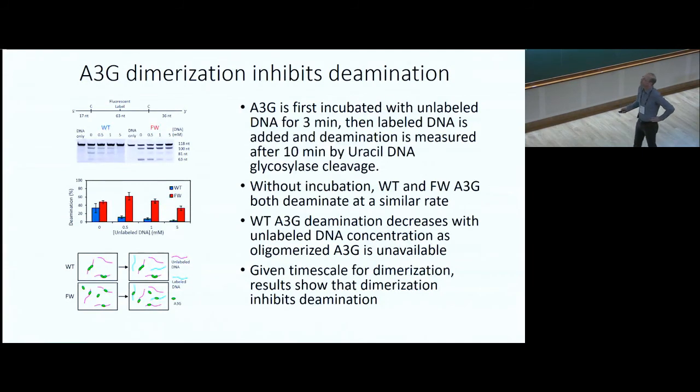Okay, and so what you get is a gel that shows you the different lengths, and you can see whether one of these was chopped, or two of them were chopped, or none of them were chopped. And the problem is that as soon as you do the experiment and add this, by the time it would normally dimerize, it's already done this process. So that's why they never see it, because they're using such short DNA molecules, but they can't use long ones.